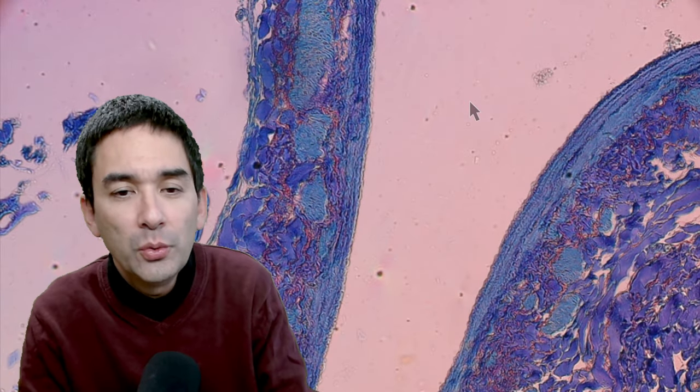But you might wonder why in the world is the inside of the blood vessel so flat. It's here in the artery, and then over here in the vein as well. It's kind of compressed together quite a bit. And I actually want to show you something.